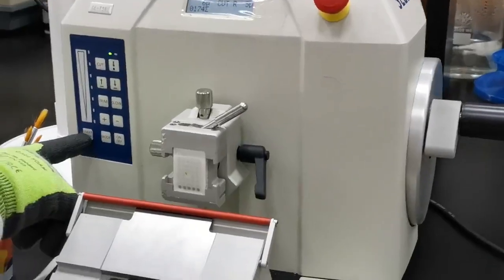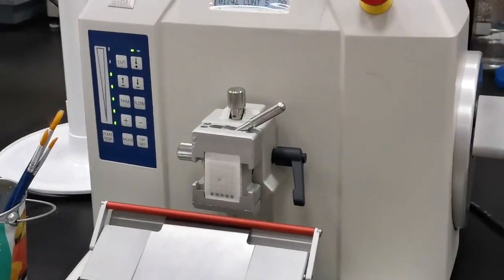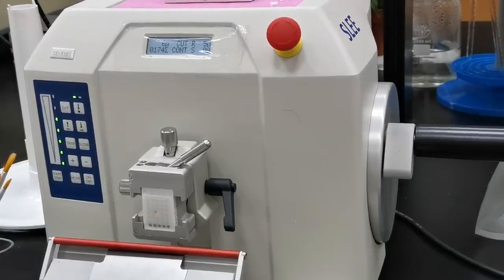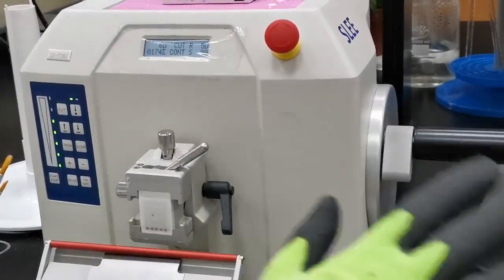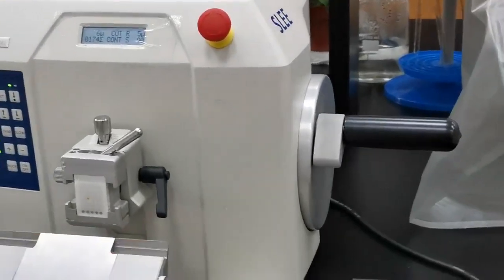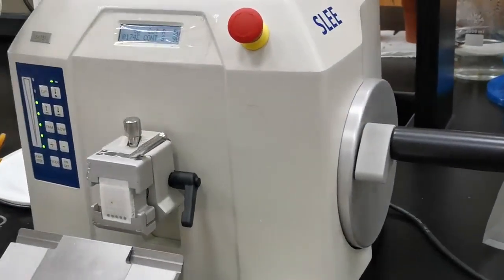Then you need to turn it on again. Regarding trimming and alignment, it works just the same as with the manual microtome. The first thing you need to do is install the knife.